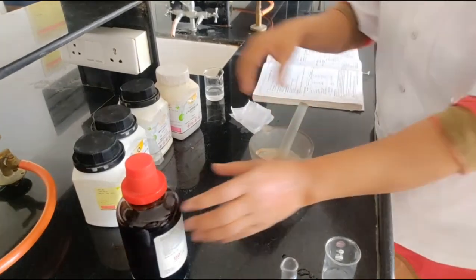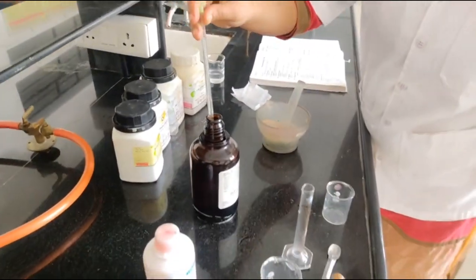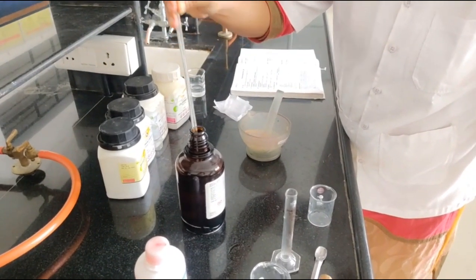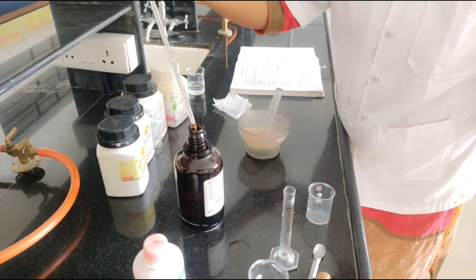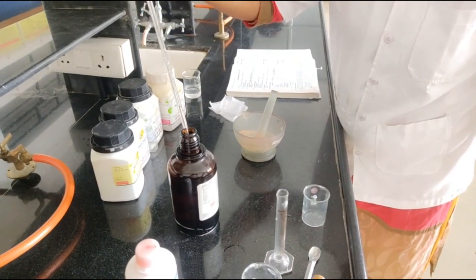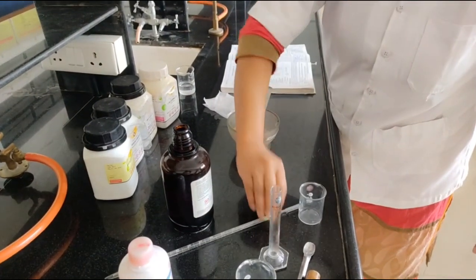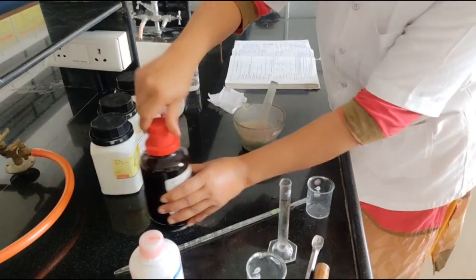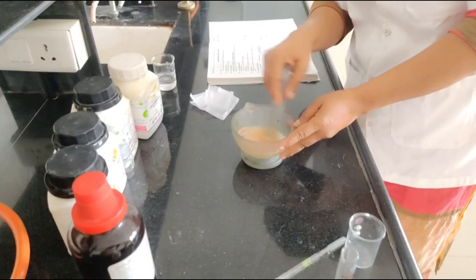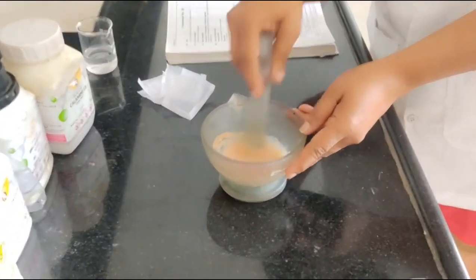Then we add the liquefied phenol. Liquefied phenol's quantity is 0.05 ml, which means 1 to 2 drops only. This liquefied phenol is added as a mild analgesic and soothing agent.